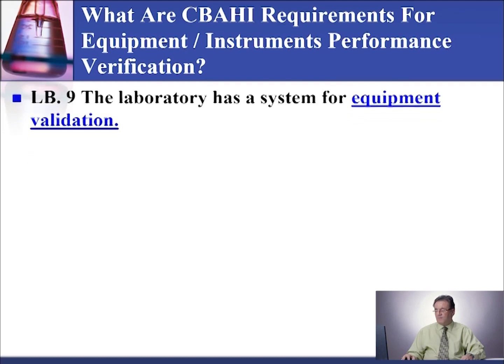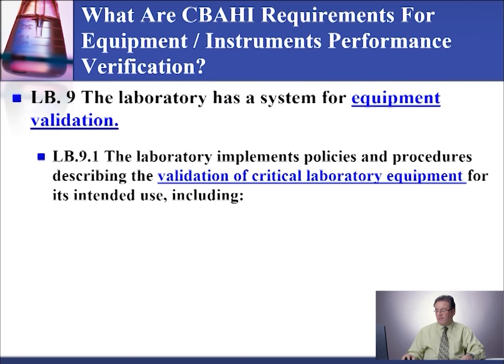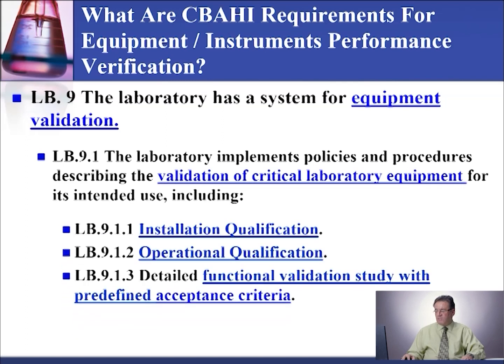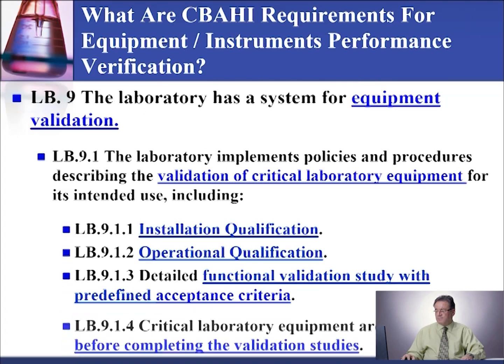The testing activities that you need to do for the OQ phase are as follows. First, you need to check the software functions. As applicable, check critical elements and functions of the application software to show that the whole system works as intended. For example, data capture and analysis, result reporting, security, access control, storage, backup, and archiving at the user site according to written procedures.